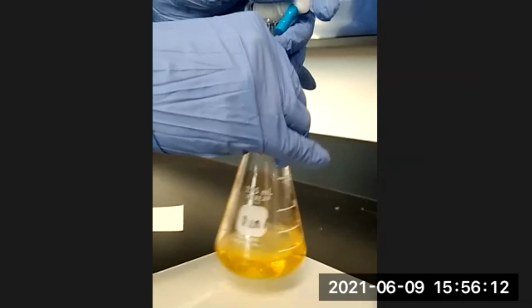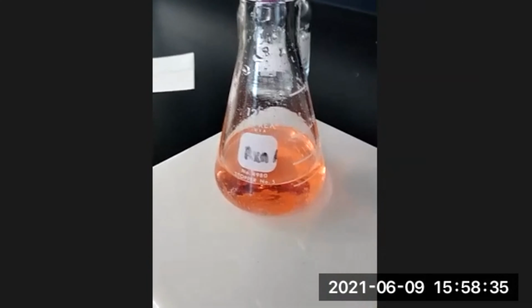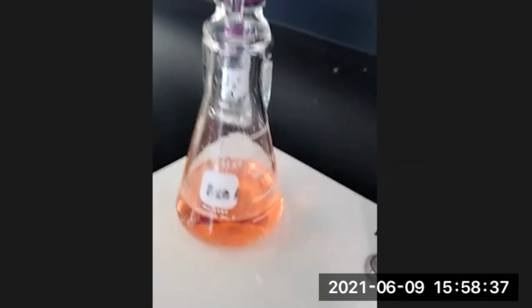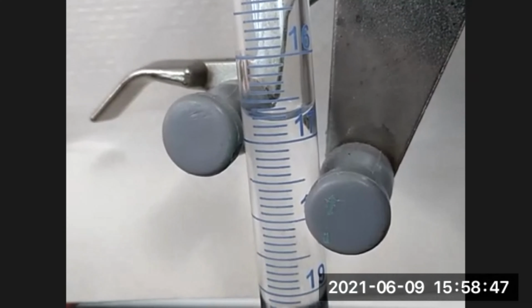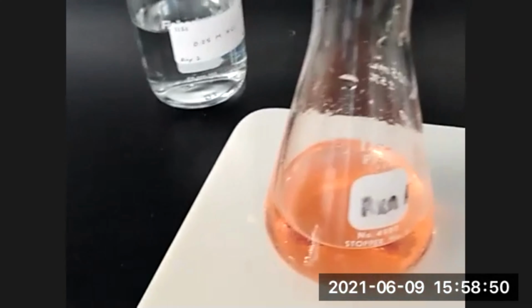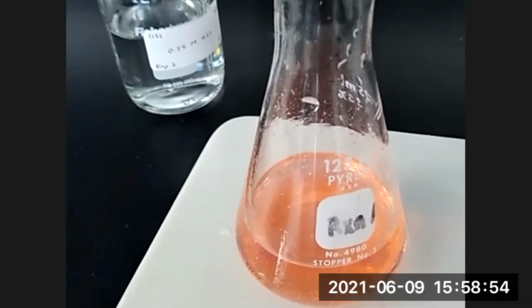So you keep on adding the HCl, and eventually it'll turn this nice peachy pink color that signifies the end point, and that's when you stop adding HCl. So here it took about 16.75 milliliters. So we started at 0.4, it took 16.75 for the color of the endpoint to be reached. The endpoint correlates to the equivalence point, which means that all of the base has been neutralized by the acid.